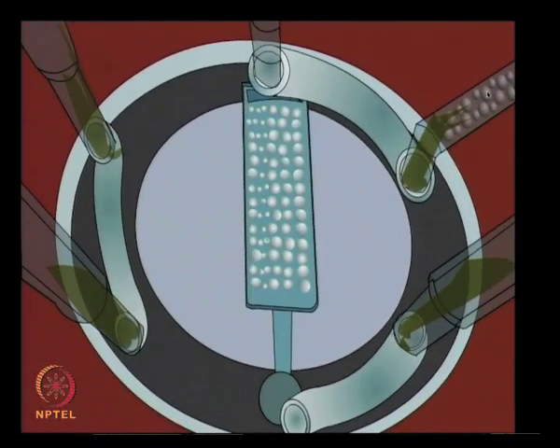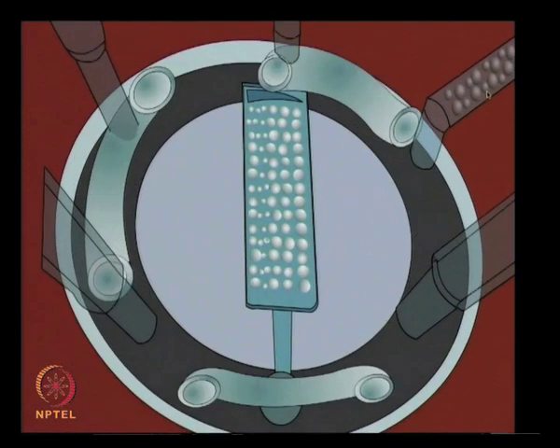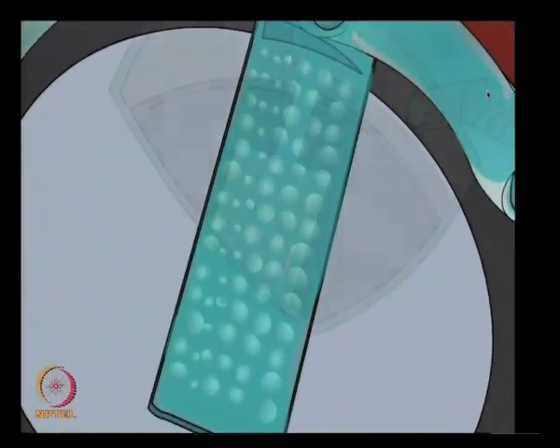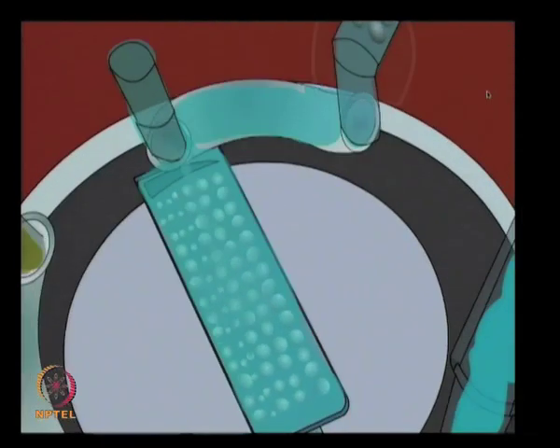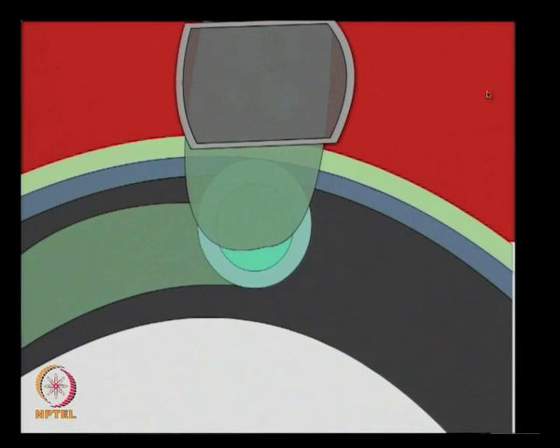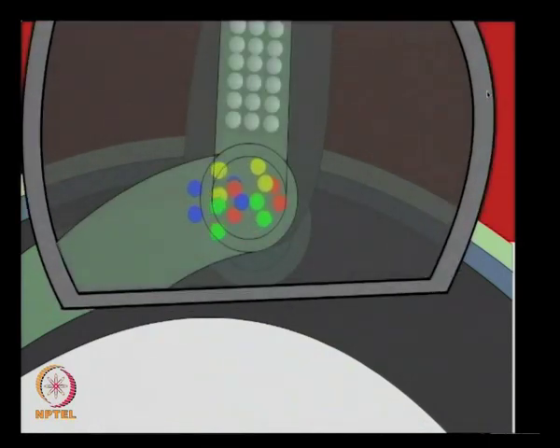The chip based technology reduces the possibility of leaks and dead volumes. It improves sensitivity and reliability during the liquid chromatography steps. By making the integrated system, it avoids several pitfalls which are associated with separate tubings and fittings.